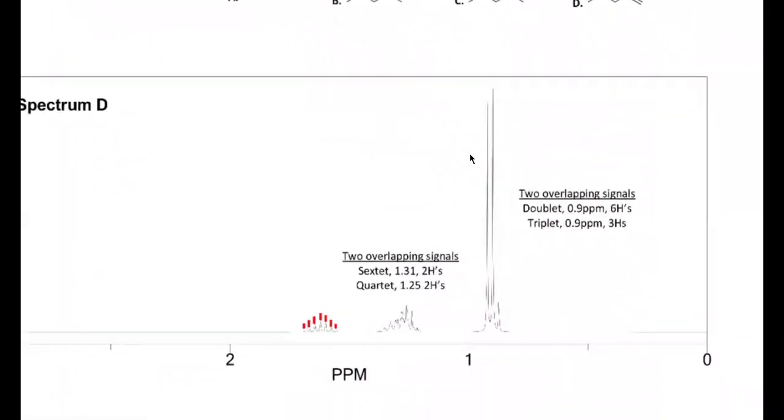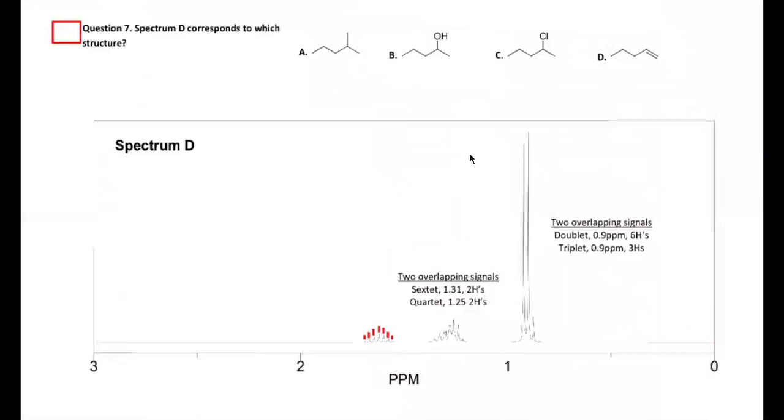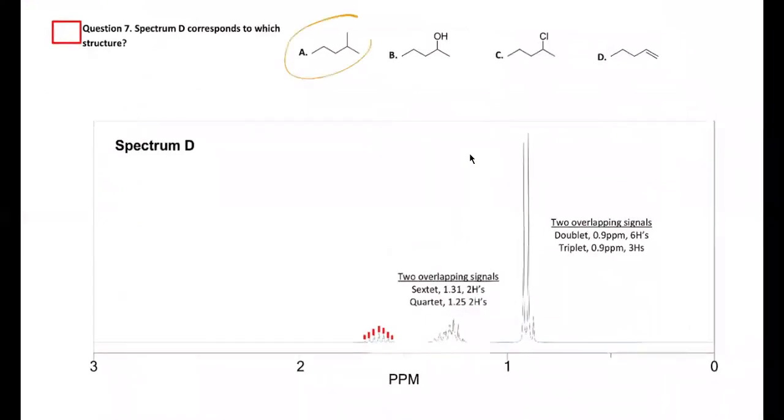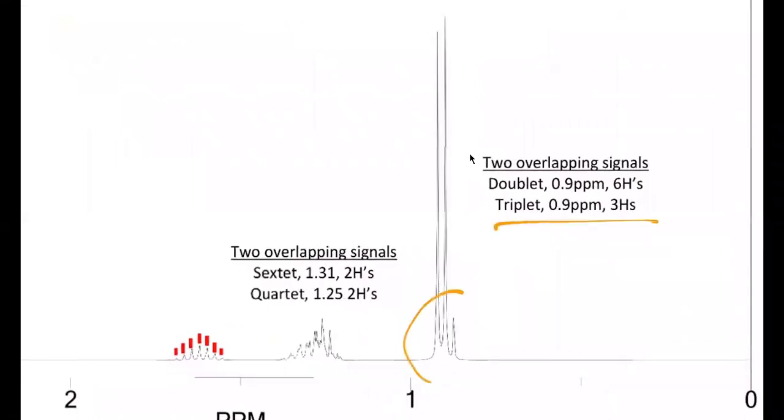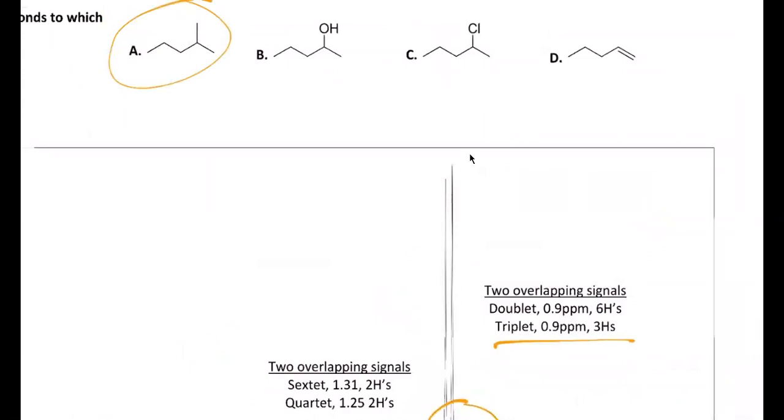And then you can see here, this is just a mess, right? It's the alkyl chain right here. There's a triplet buried underneath here. I tried to put that in here so it wouldn't confuse you too bad, but there's a triplet buried underneath there. And there's also a doublet for those 2 CH3 groups that are right here, because they're equivalent. And the integration is 6 hydrogens. There's a triplet buried underneath there that integrates for 3 hydrogens. So let's see if we can pick them out.